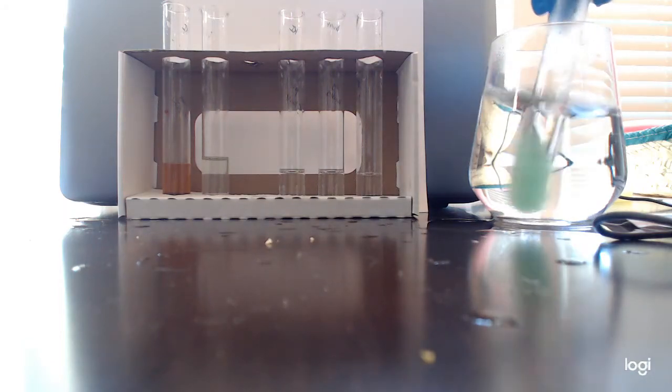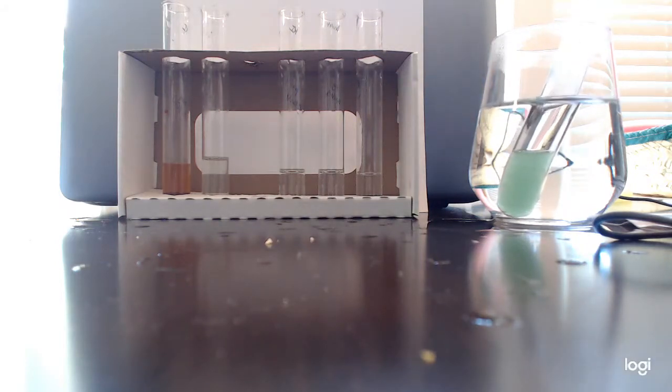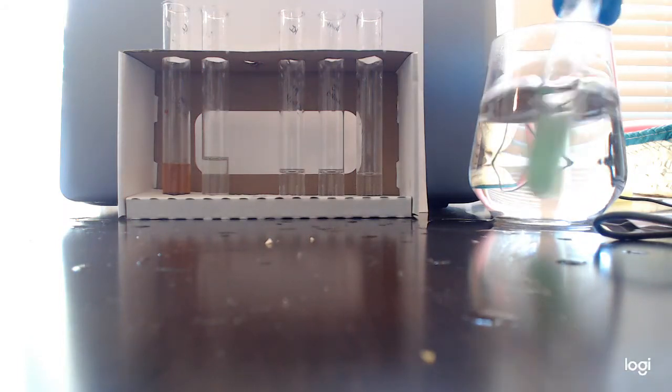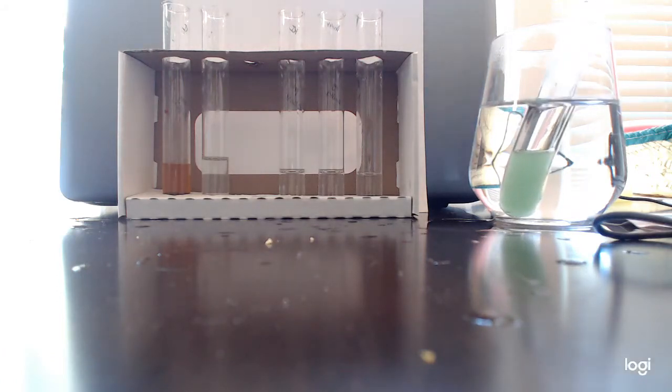And in this experiment, the sugar not only changes the solution a different color from blue to orange, but the sugar that's making that color change happen will precipitate or become solid, come out of solution, and kind of glop at the bottom as this red oxidized copper color.